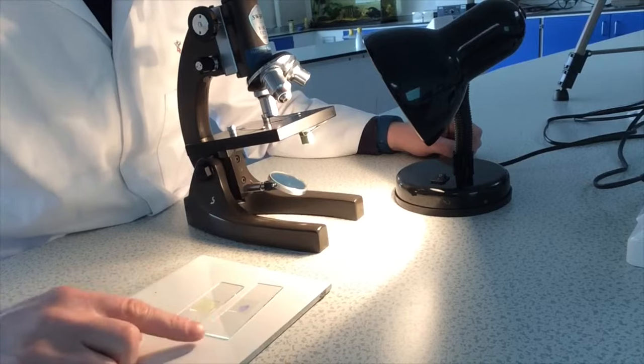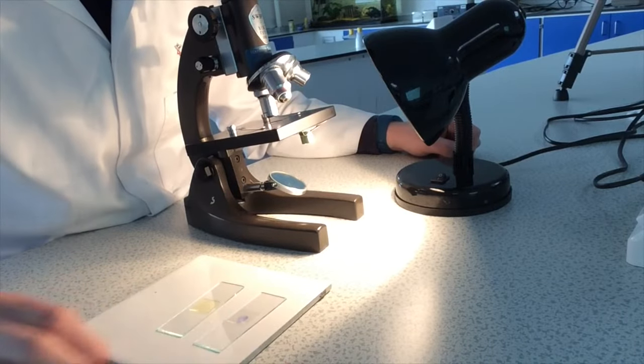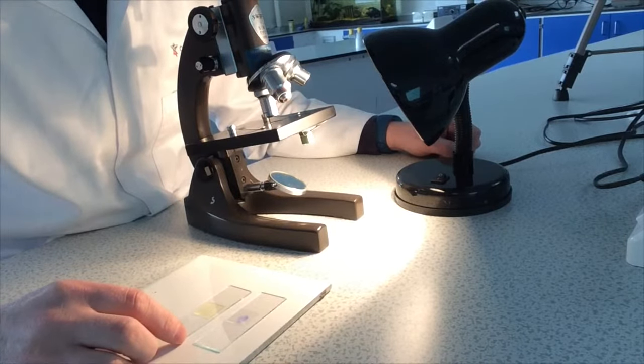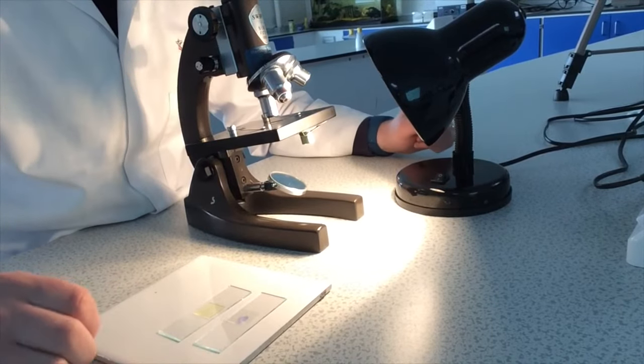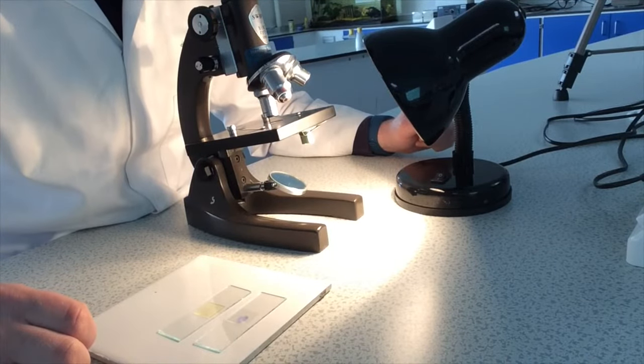Now I have my animal cell slide which is my cheek cells and my plant cell slide which is some onion cells. I'm now going to view them under the microscope and hopefully identify some cell structures.